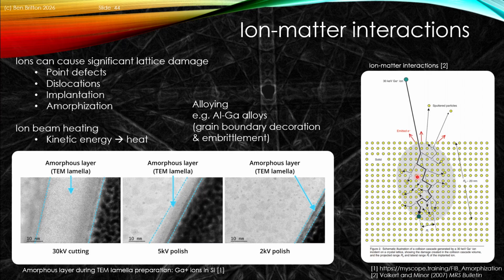And we can also get the formation of implanted ions in that material. Now, this will happen at a relative temperature, and of course this lattice itself can repair itself. So there might be enough time, so although you get this collision cascade, actually the lattice can reconfigure, and effectively all of these atoms that were displaced can recombine and repair. Now, why is this important?